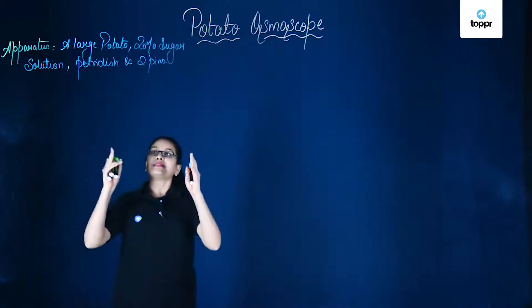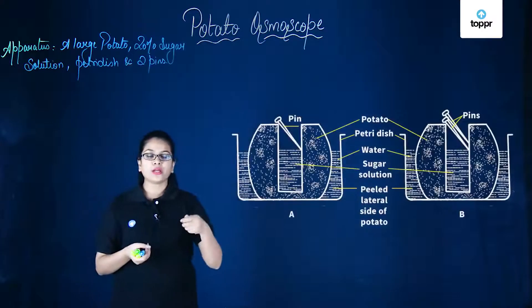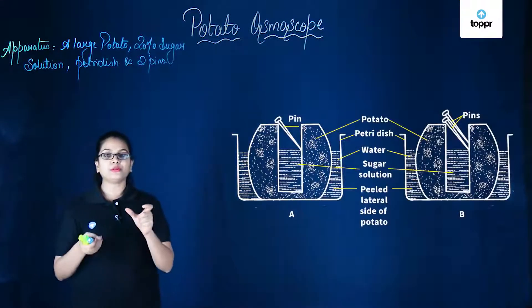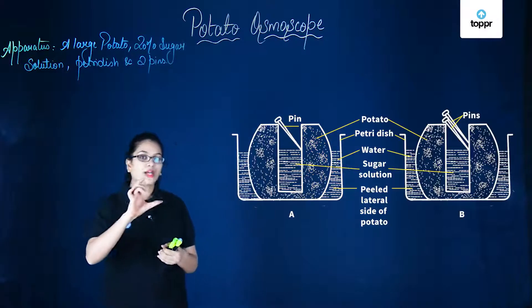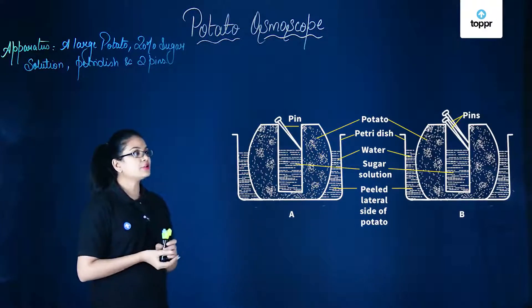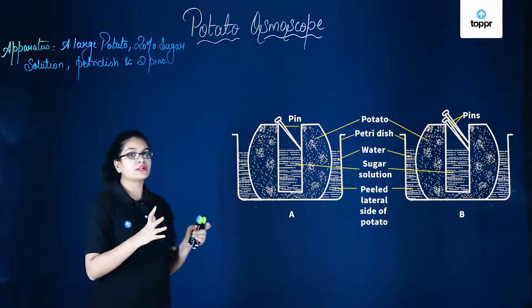So what all you need is this. To start with, we will peel a potato, and from one end we will cut it flat so that it can be placed on the table evenly. Next, we will bore a cavity inside, and now we have got this osmoscope. As displayed in the figure, you can see that the potato is placed in the petri dish which is filled with water.